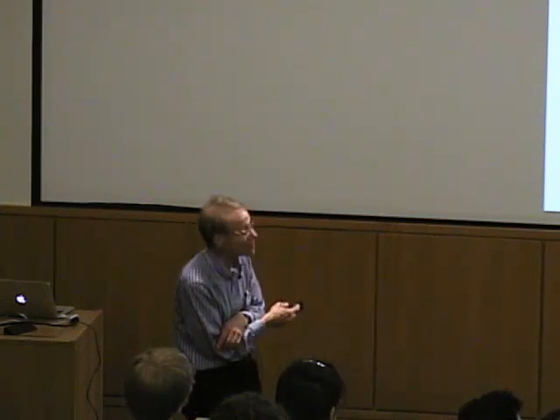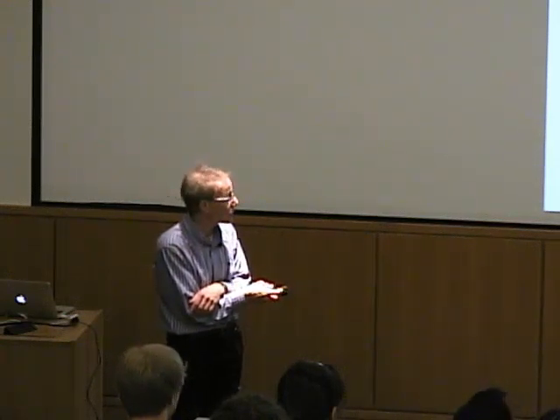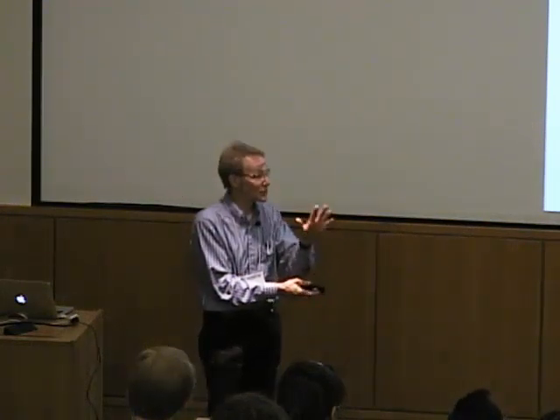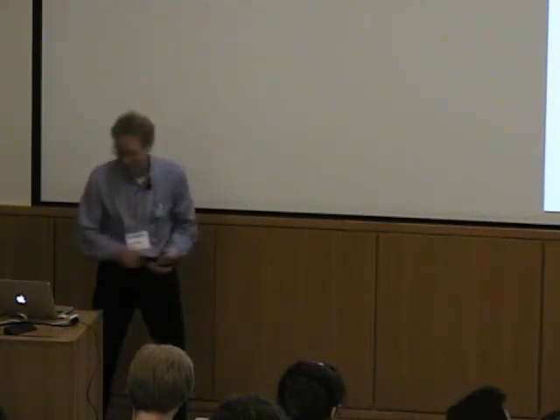Okay, and so if we do a proton inventory, we predict from pKa's that, in fact, about 1.7 protons should be displaced from the protein. And we measure 1.5. So pretty close, a good match between experiment and what you predict from other experimental data.